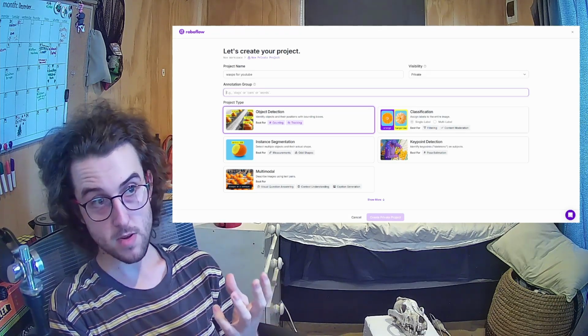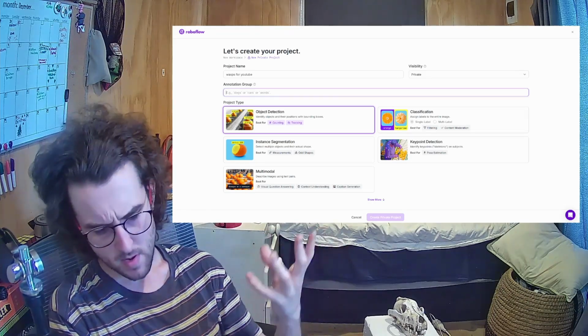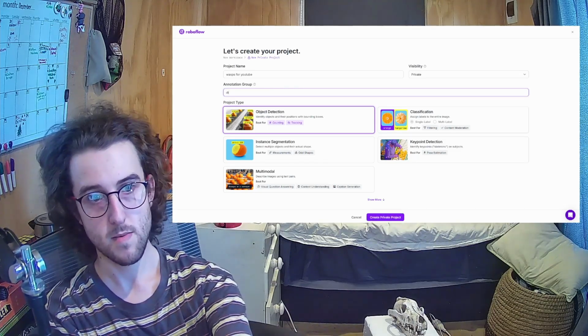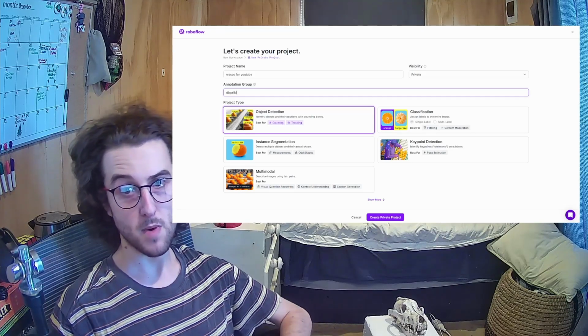So what we want to know is, is it a diapriid, is it an ichneumonid, or is it a chalcidoid? So I'll put diapriid in as my starting object group. Cool. And then we choose our model.